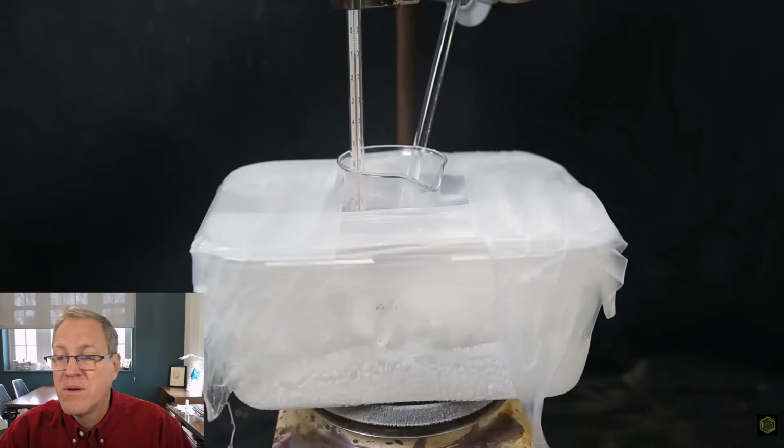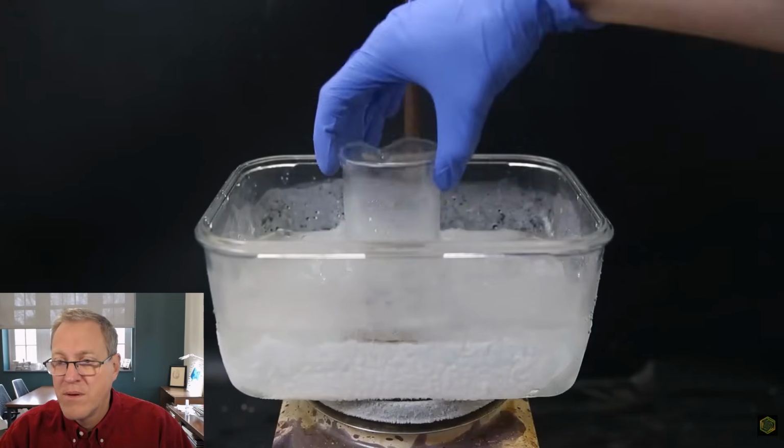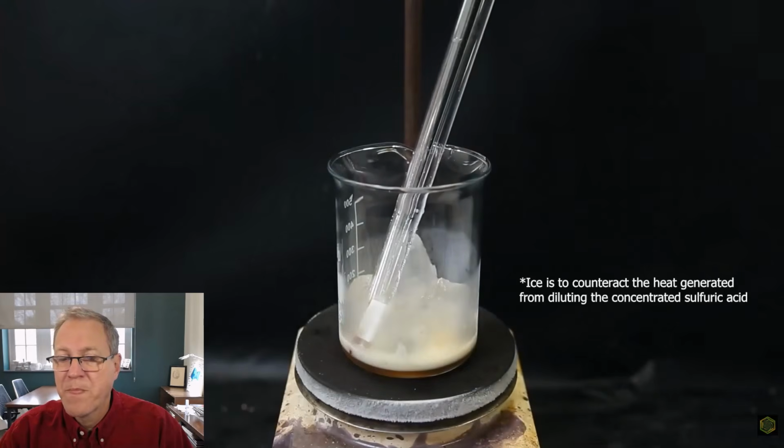When the addition was complete, I left it to stir for 30 minutes at minus 10 C. This is what it looks like, and when it is done, I take it out of the dish. I then immediately set up a beaker with ice and pour all of the mixture into it. I wash it out with some water.